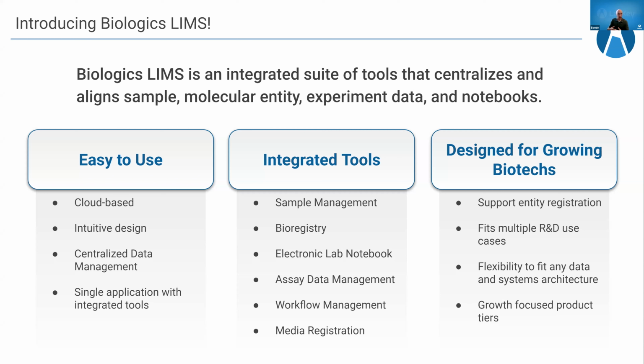Really, it's a combination of many powerful components of LabKey's existing product suite, including everything you learned about Sample Manager yesterday, plus unique components specifically designed for biologics research and development. It is built on LabKey Server, making it a highly adaptable system suited for wide-ranging use cases. I'll have the chance a little bit later to dive into more of those specifics during my demo.